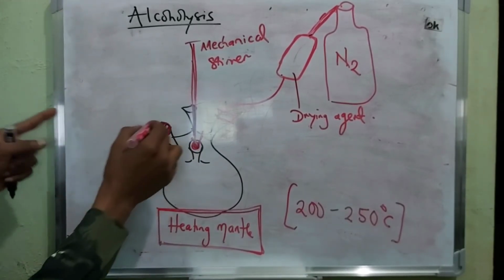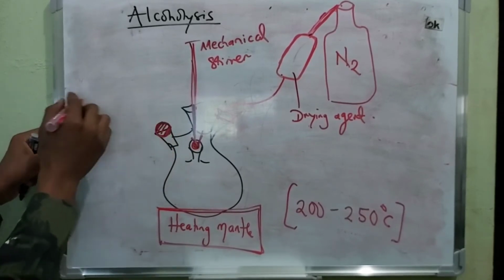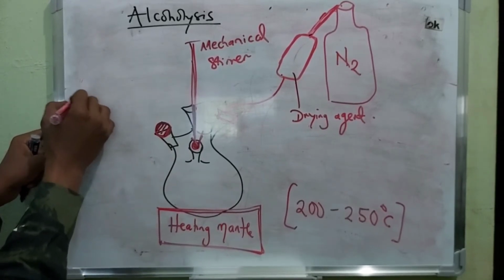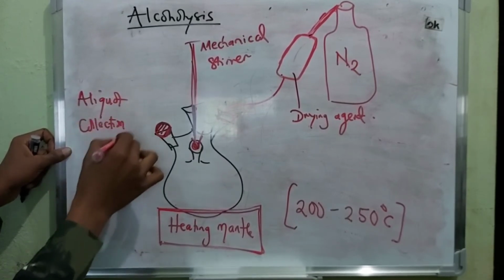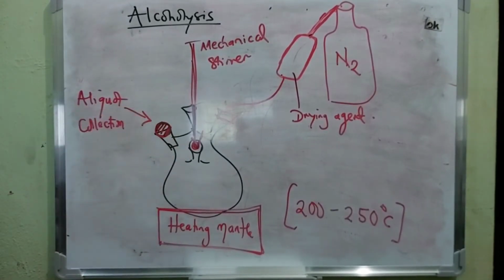From here we can withdraw aliquot or introduce reagents. So for aliquot collection and testing, even the temperature drop, you can use that.